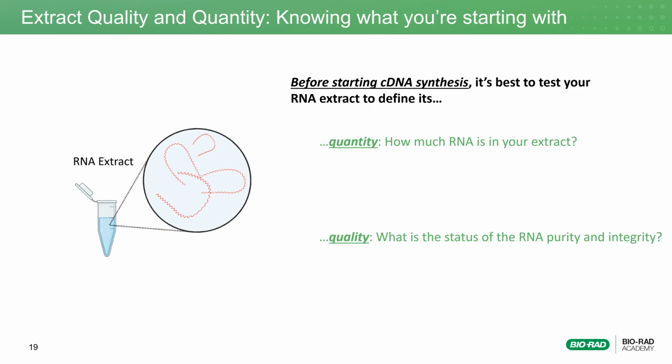As we begin to explore these methods, keep in mind that quantity of RNA is largely determined by the yield of ribosomal RNA, or rRNA, whereas the quality of RNA is determined by the purity and degradation status of the RNA molecules. However, there is a significant overlap between the two factors since it is difficult to assess the quality of a sample with low quantity of RNA, and parameters which affect RNA quality may interfere with the quantification process. Let's take a look.